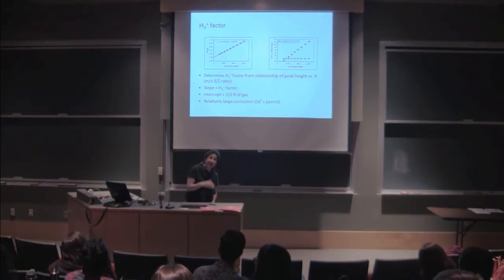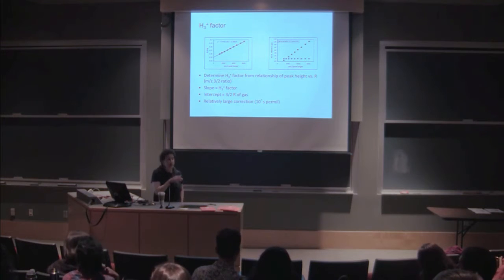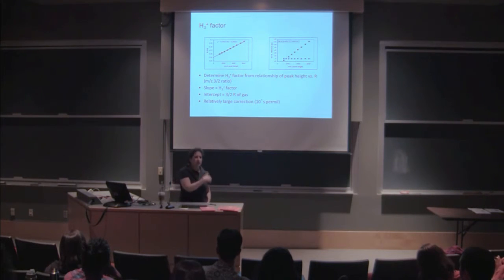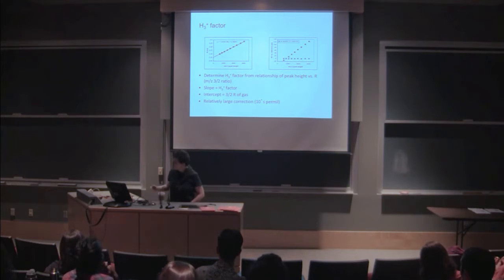So here's just an example. You can sort of vary the peak height of your hydrogen standard gas and measure the ratio and then apply that slope to another unknown and then end up with that nice flat delta value as a consequence. So it's fairly straightforward. It's been done for years in dual inlet mass spectrometry. There's no secret here. It's not a new thing. But it is bigger for the continuous flow techniques. The production of the hydrogen three ion tends to be more efficient for whatever reason in the ion sources where there's helium flow as well. So it can be a fairly large tens of per mil kind of correction. So it's important to pay attention to it. It's often in the software as kind of a canned number. And I don't know, I never like to be told what to do. And so I like to know what that number is and I want to know who generated it and why and is it right for today and the samples I happen to be running. So if you're working with hydrogen in these continuous flow things, pay attention to that H3 correction and understand what number you're using and whether it should be updated.